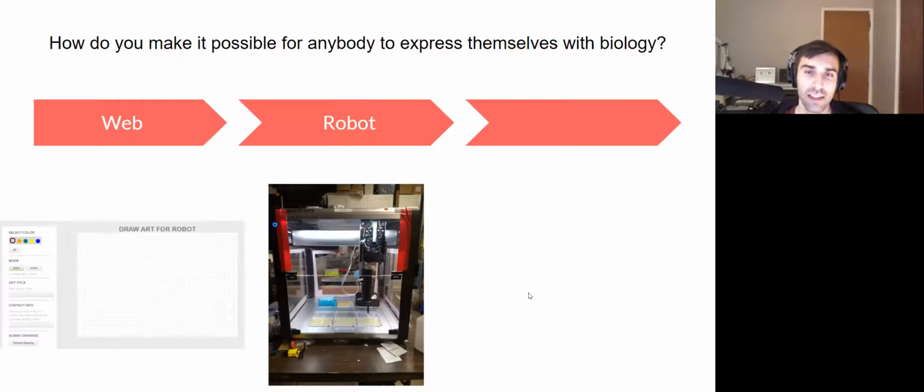But yeah, mostly the five E. coli strains that we used were the ones that were distributed as part of the first time that ASM did the agar art competition with the community labs, and I believe they may have been generated by somebody at Bugs. So they are just E. coli with some of the chromoprotein BioBricks.